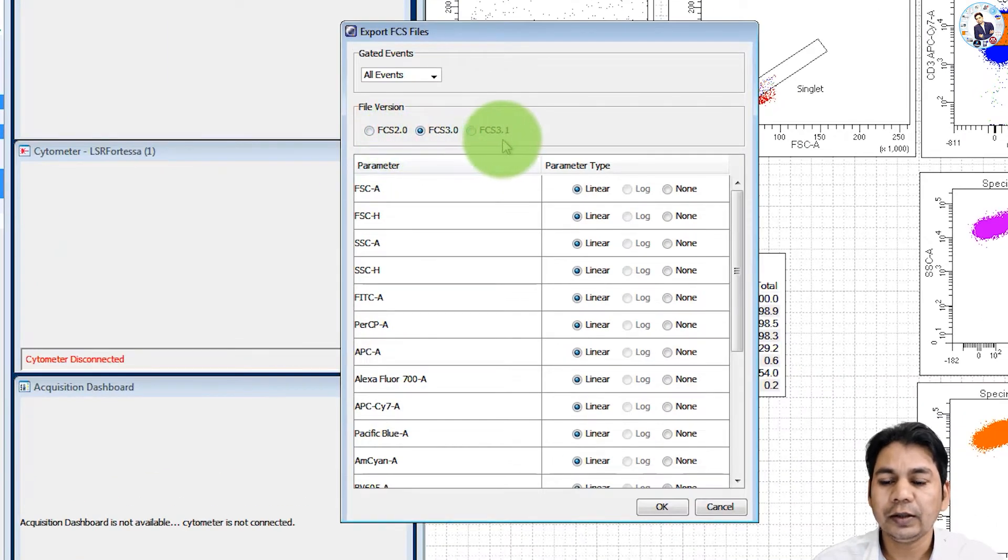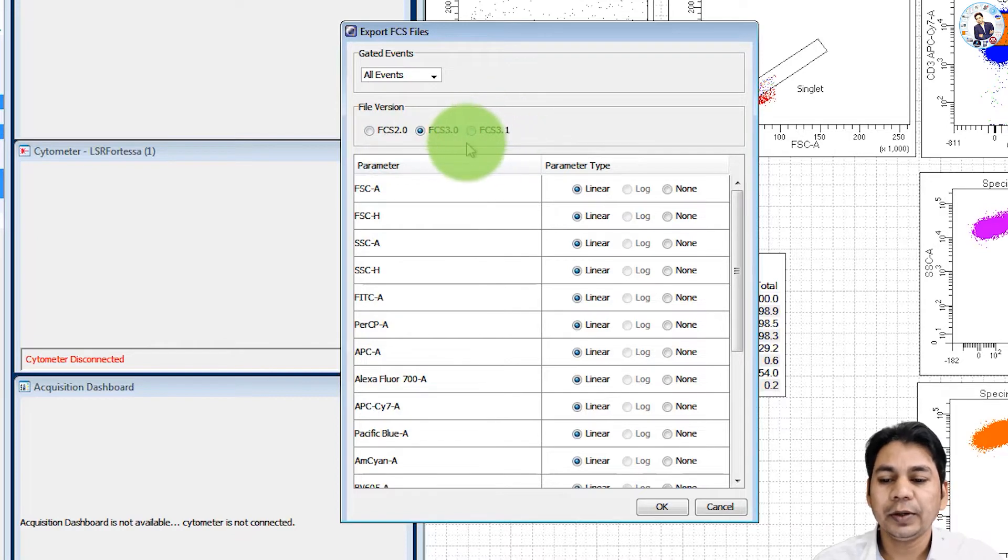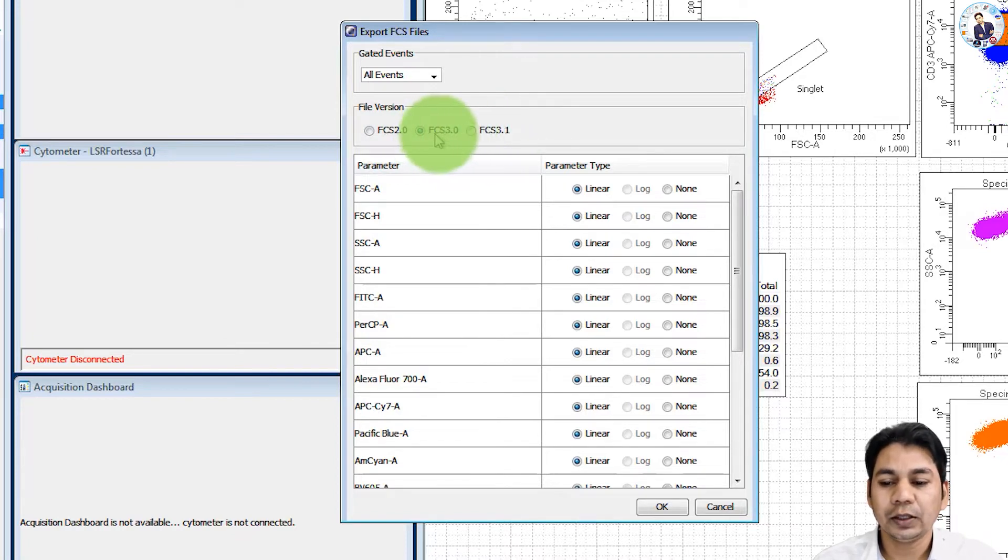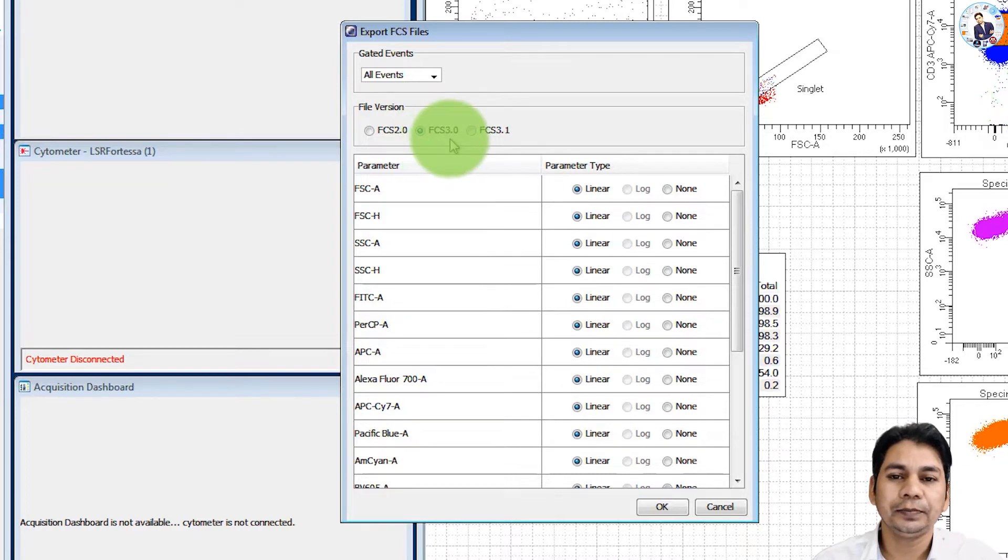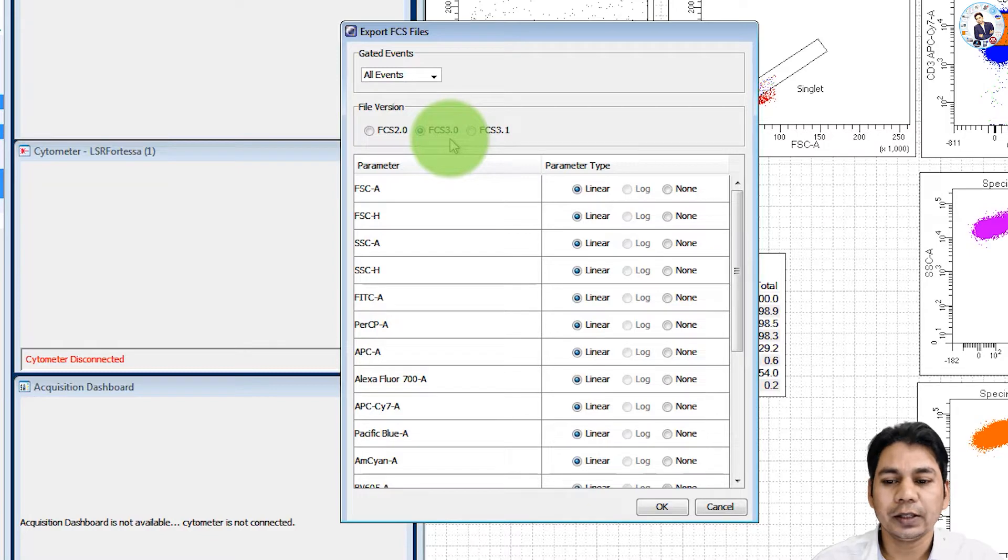I recommend you please export FCS file version 3.0 because generally it supports all the third-party software that are used for data analysis of flow cytometry data.